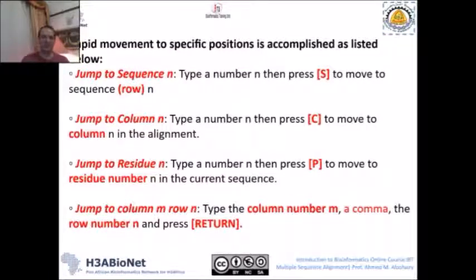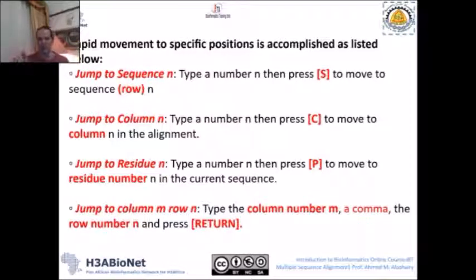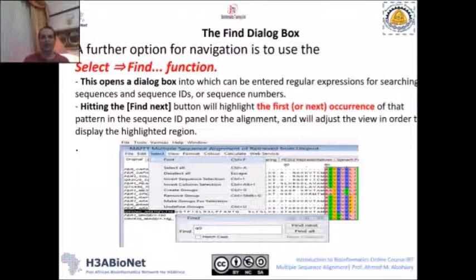To go to a specific column number N, type the column number and then press C. To go to a specific residue inside a sequence, type the residue number and then press P. To jump to both a specific column M and row N simultaneously, type M, then a comma, then the row number, and press Enter. This allows you to navigate to any specific column, residue, or sequence in cursor mode.